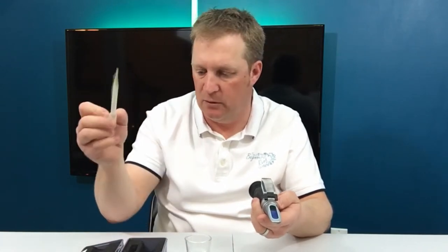To use these, they're really simple. All you need is a sample of your aquarium water. In the box you'll usually get a cleaning cloth, a set of instructions, a pipette for putting the water onto the visual slide, and an adjustment screwdriver.